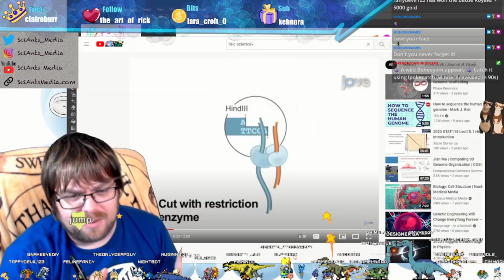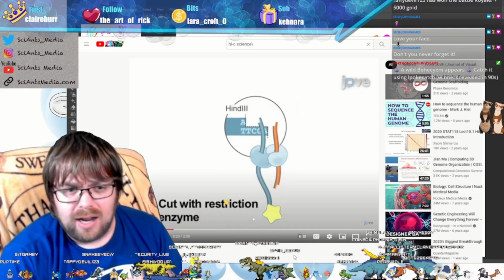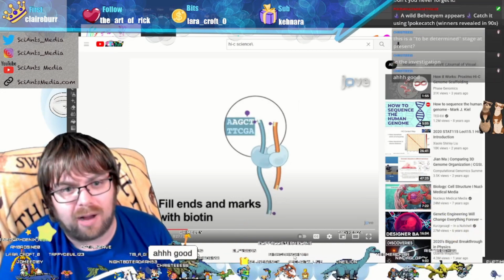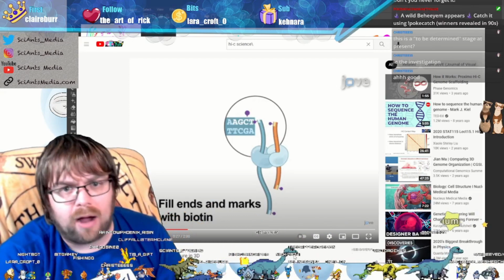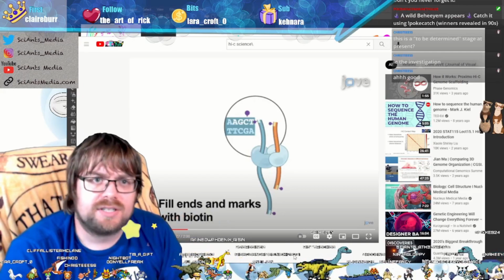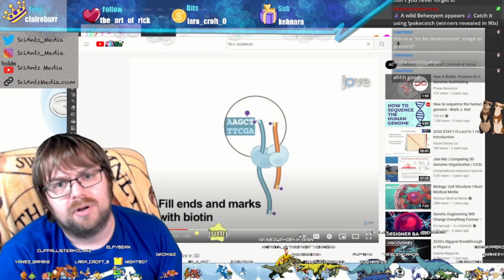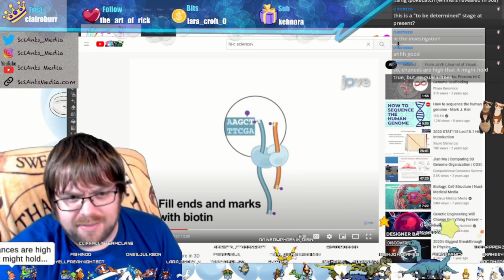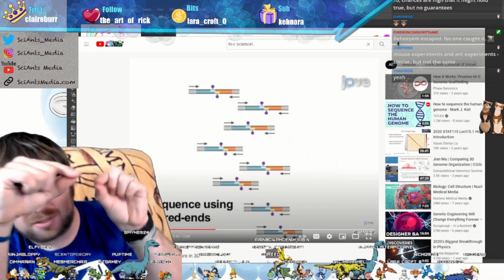Cross-linking is what they do. They stick them together with a molecular glue and then cut them, and then they'll sequence and figure out what was closest together. Like in mice, you can ask the same question. Like during development in a mouse, how are the cells different? Are the cells that are becoming your liver cells different from your pancreas cells and your brain cells? And is that connected to the overall structure of the DNA inside the cells at that time? And so yeah, with this, you get the little circle.